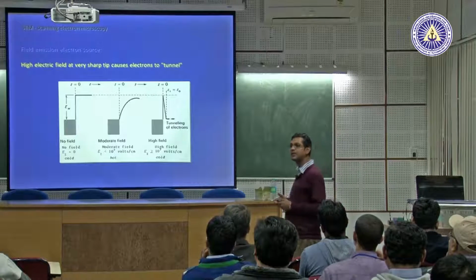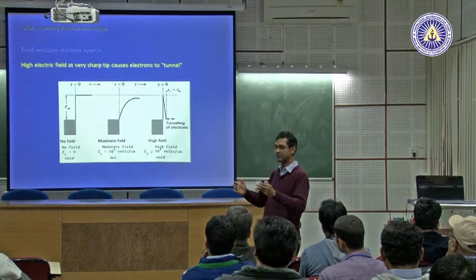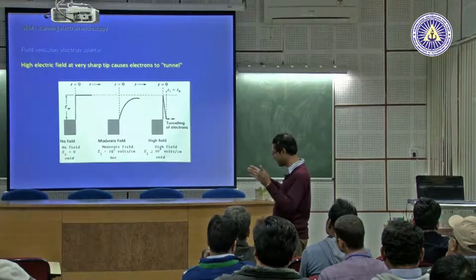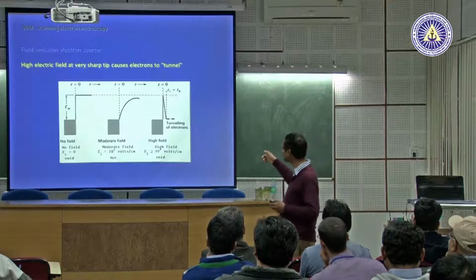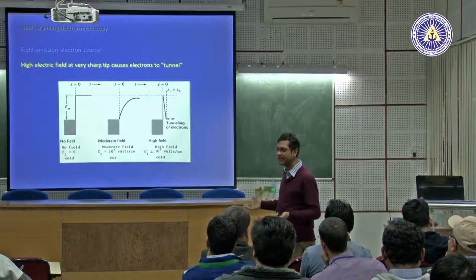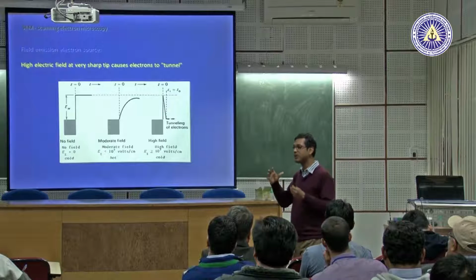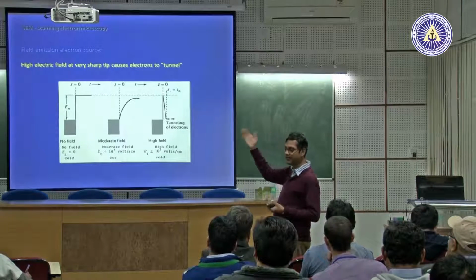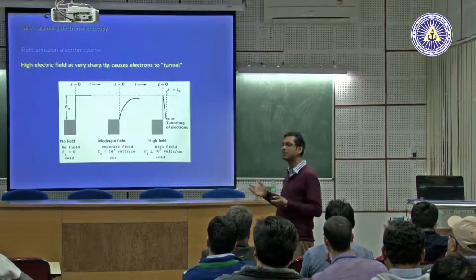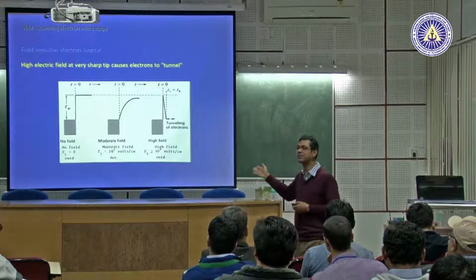First advantage is that the wavelength is not changing, but your aberrations are reducing, so you can reduce the width of the electron energy by using this tunneling aspect. Second is that your source is brighter. Bright means what? If your number of electrons per unit area is larger, then it is brighter. The sun is brighter than the moon or stars, because the sun is radiating more light. Exactly the same thing happens.